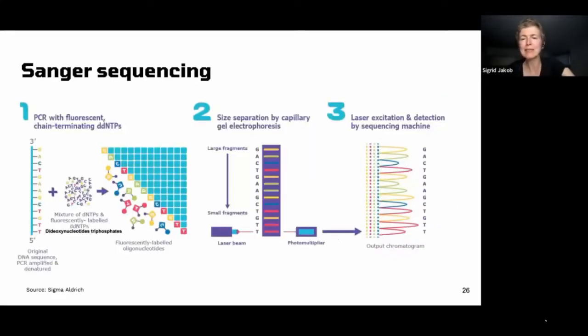So the last step, Sanger sequencing, like I said, requires an incredibly expensive machine and experts in white coats. And to explain it is a little bit painful. I'm not going to spend a ton of time on it, but basically they're doing PCR again, and they're doing gel electrophoresis again, except when they're doing PCR, there are specially fluorescently labeled oligonucleotides that cut off after a certain length.